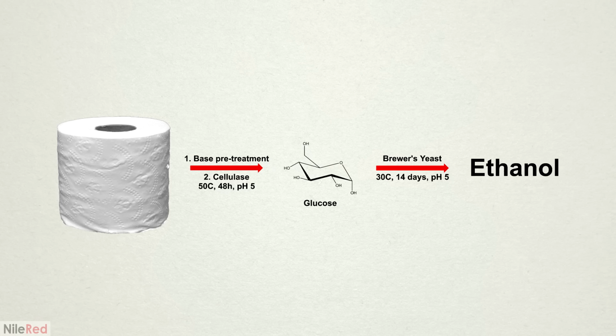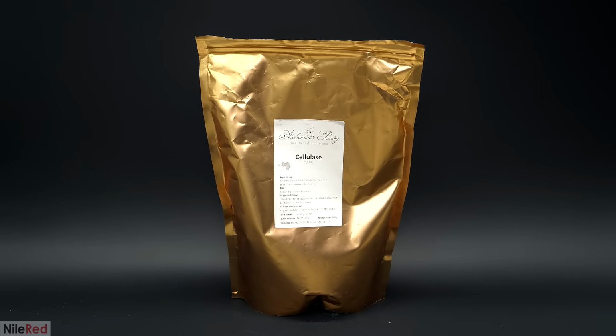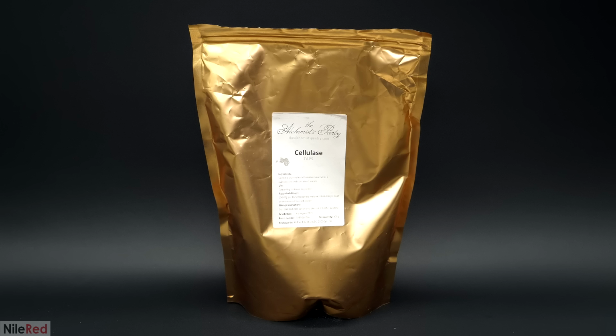It honestly took me a while to figure it all out, but after a bunch of research, I eventually came up with something that was relatively simple. To do it, all I needed was some basic equipment and a few easy-to-get chemicals. When the enzyme eventually arrived, I considered doing some small-scale tests to verify that what I came up with worked, but it was such a simple process that I decided to just wing it and go all in. If it ended up working, it would save me a lot of time, and I figured that at worst, I'd have a bunch of sad failure footage that could be used for something.